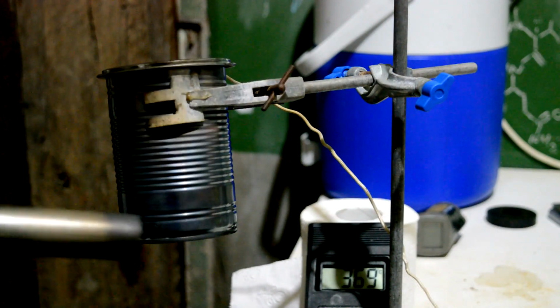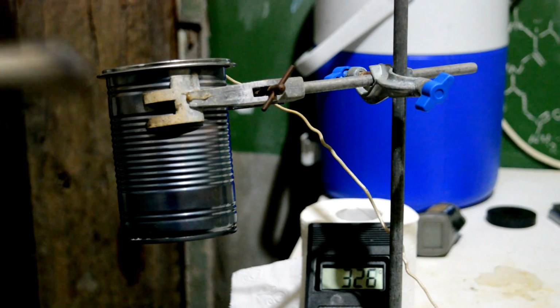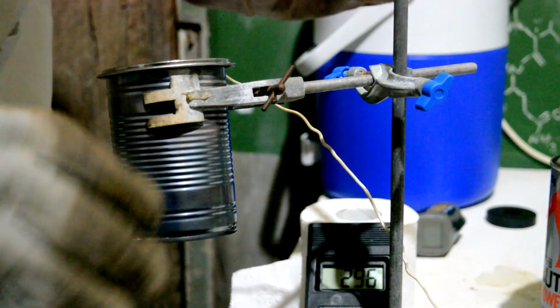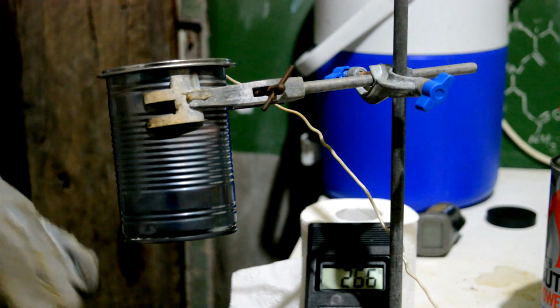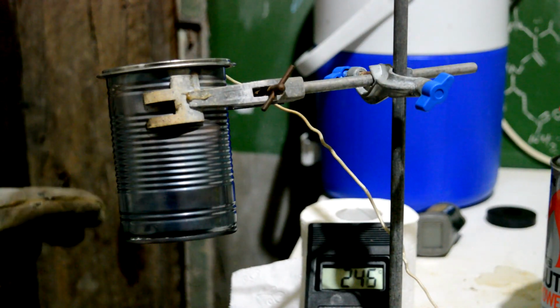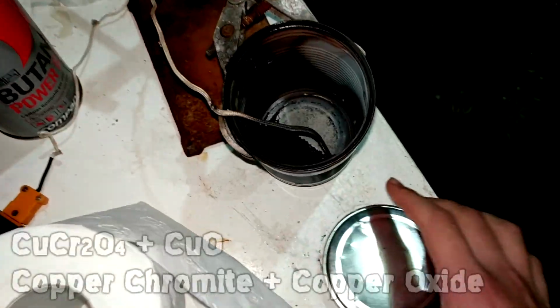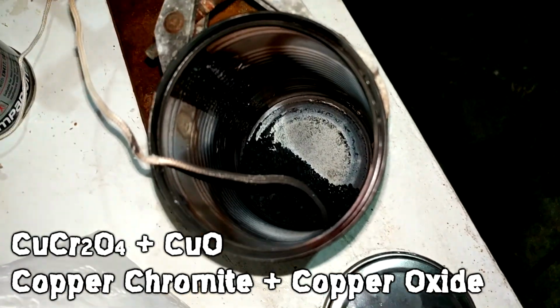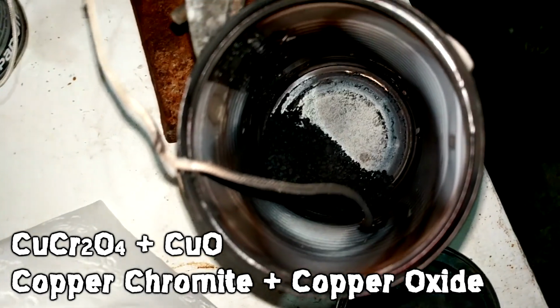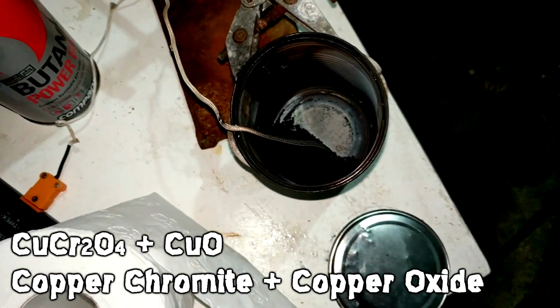Alright, it's had 10 minutes of between 300 and 400 degrees, at times getting just a little bit over 400. So I think that's good. We'll let everything cool down and then have a look, see what we're dealing with. Alright, let's do it. Oh, that looks mint. Beautiful. Alright, let's get it out of there, let's weigh it.